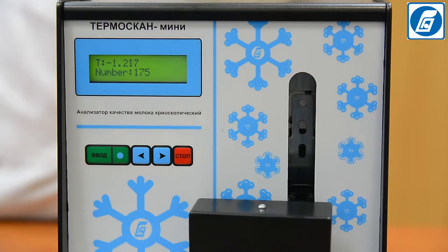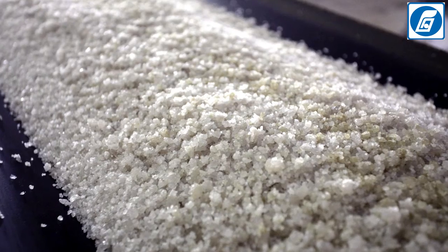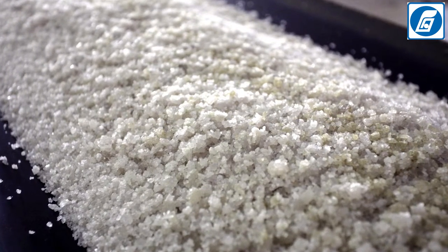If crystallization of the milk sample does not occur, the most probable reason is the presence of added salts in the milk, such as potassium chloride, sodium chloride, etc.